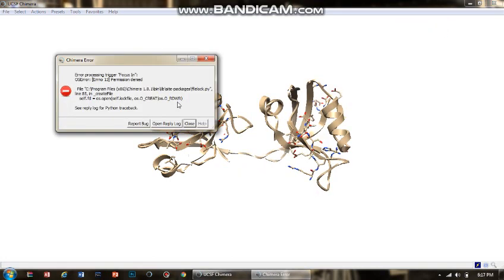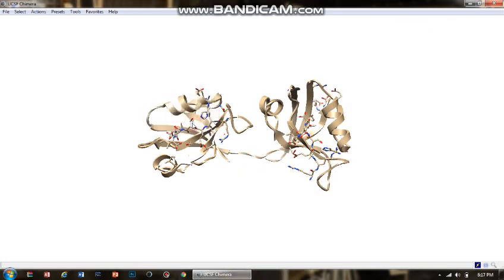Today I am going to talk about how you can view your macromolecule in different ribbon representations. There are three types: rounded ribbon representation, flat ribbon representation, and edge ribbon representation.